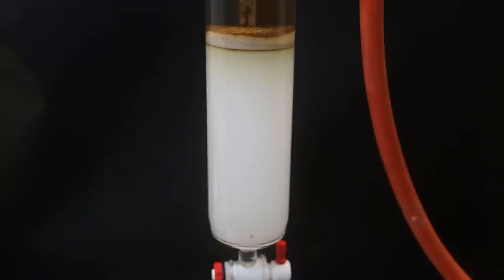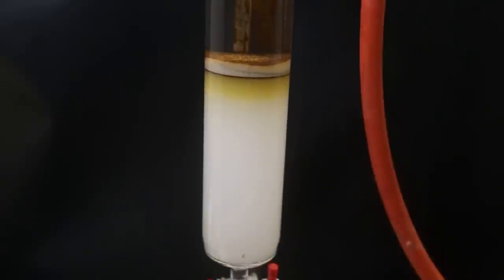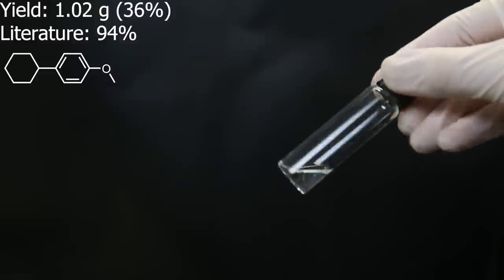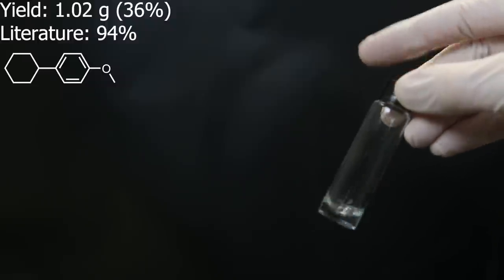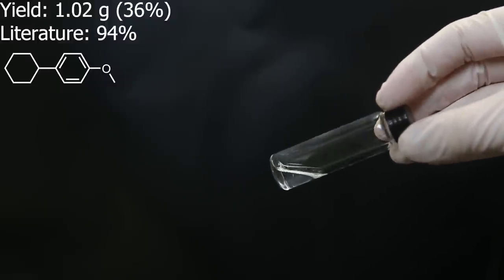I apply pressure on the top of the column with the exhaust of a vacuum pump, and run the column until my desired product comes off. When that is done, I combine all of the fractions that should contain the product, and I distill off all of the solvent with short path vacuum distillation. After all of the solvent was gone, I was left with a tiny bit of clear liquid, which should be the product. The spot on the TLC is where it should be, but unfortunately, I don't have an NMR to characterize the product properly. Still, we can reasonably assume that we have at least created some of the product.